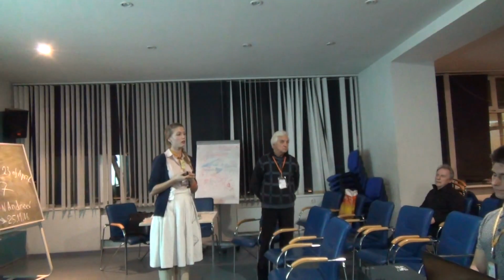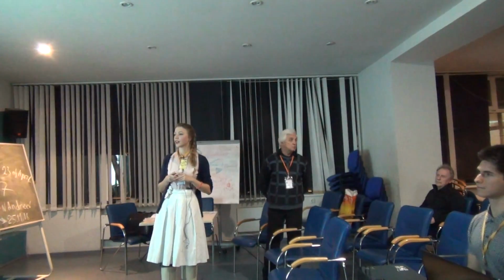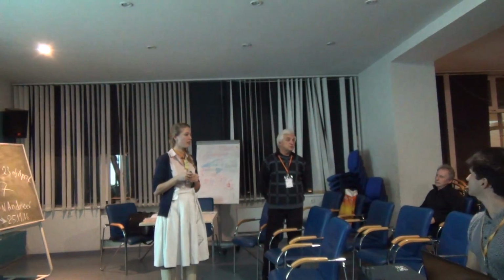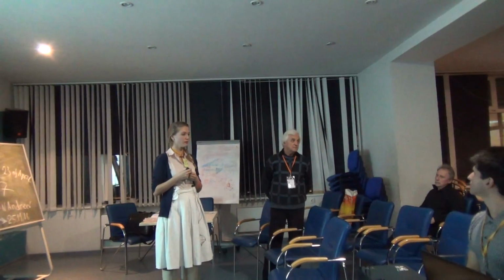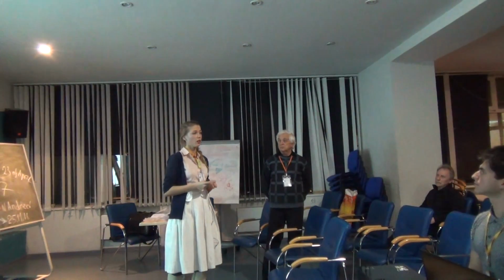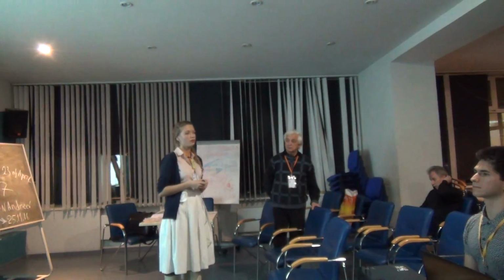Просто я смущен, что очень большой шум. На 500 мегагерц можно было его вытянуть. Почему такой зашумленный? Я просто этим удивлен. Ну, я думаю, что просто я его хорошо не отгладила. Нет, почему? Это же функциональная томография. Там чувствительность какая? Да, спектроскопия в вокселе, маленьком, миллиметр на миллиметр. Мышка помещалась в прибор, 500 МГц, под наркозом. Удивляюсь: буквально 10 лет назад подобные спектры с отношением сигнал/шум 100 к 1, 200 к 1, а у вас он как бы в шумах.